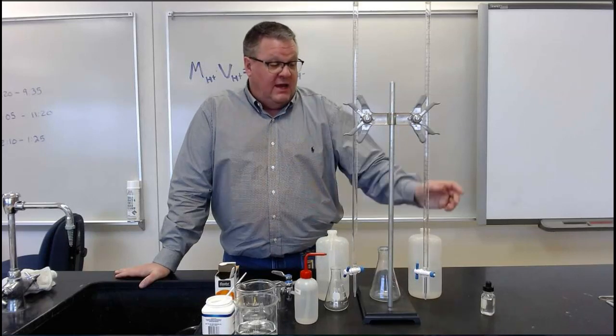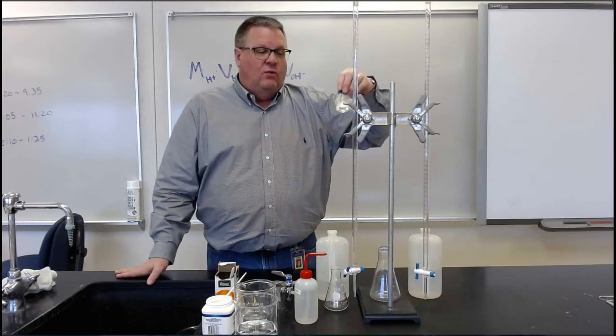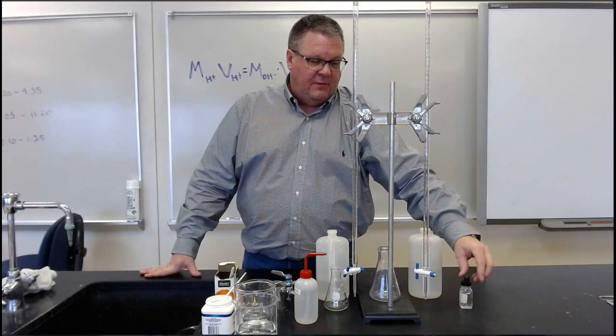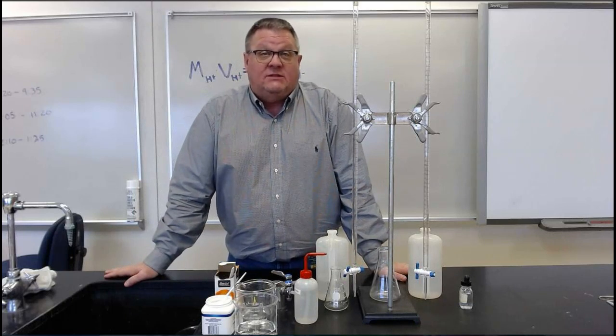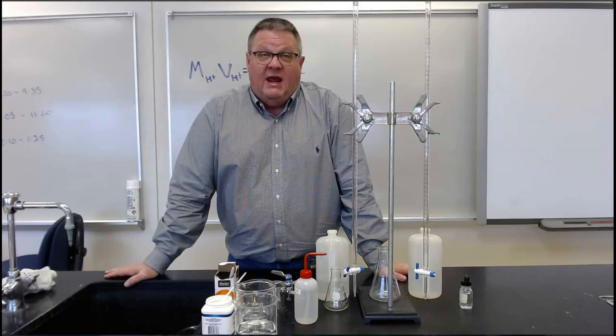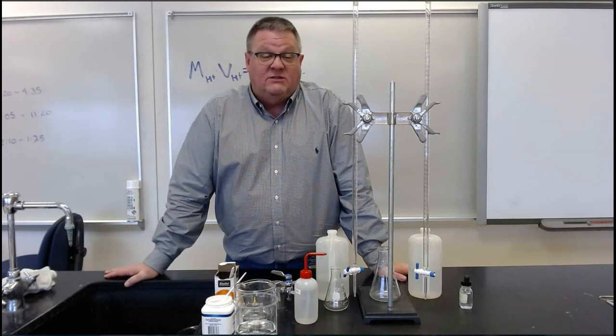We can use an acid-base indicator, phenolphthalein, and we can look for the end point, which is the color change. Phenolphthalein in an acid solution is clear and colorless, and between 8 and 10.0 pH, it changes from clear colorless to pink. So we're looking for the lightest perceivable pink to stop our addition of our base to our acid.